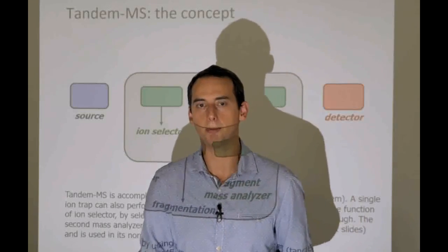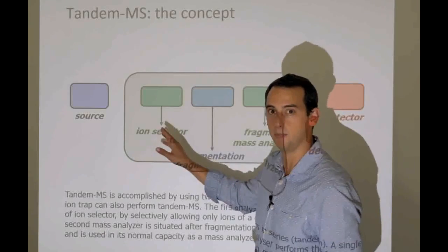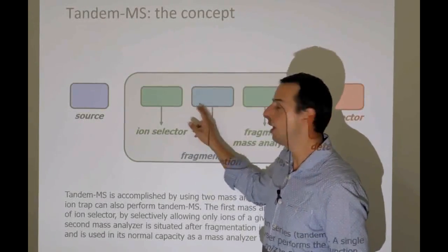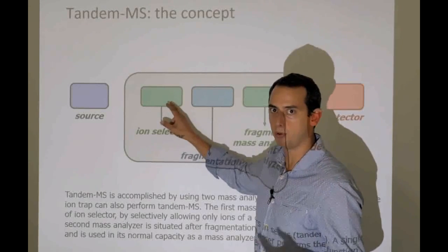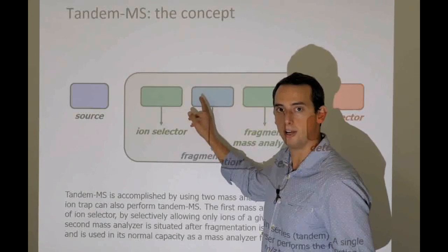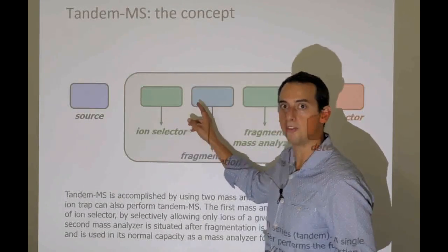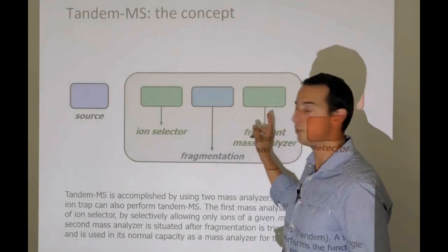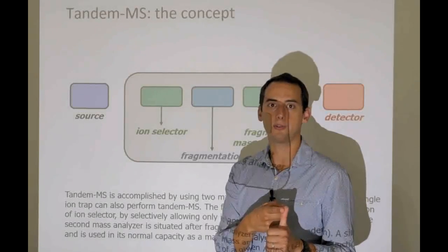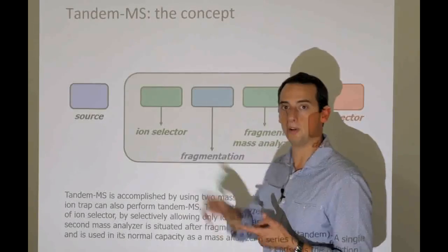It's a really gruesome example, but hopefully it will help you understand what is going on here, because we do exactly the same. Instead of letting all the peptides into the fragmentation chamber at once, we use a bouncer like a quadrupole or an ion trap to keep everybody else out and only let one type of ion in. That type of ion will then be fragmented into its constituent parts, and then we measure all the fragments. And since we know which mass we limit it to, we know what the intact mass is with a certain amount of error, because that's the mass that we let through, and we know the masses of all the fragments.